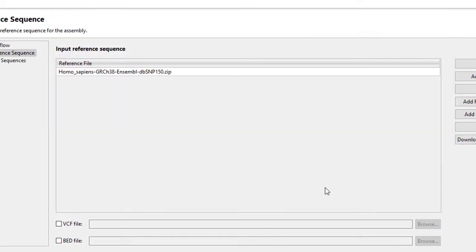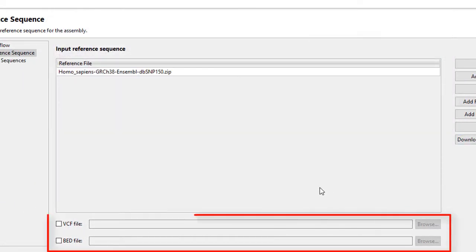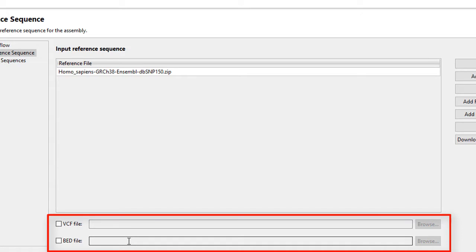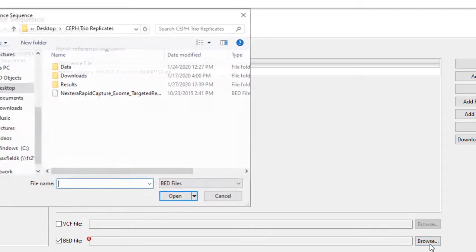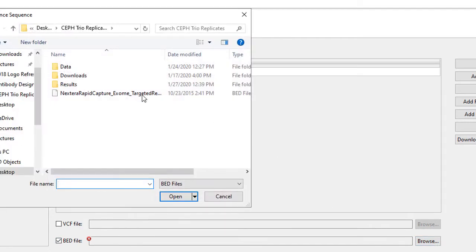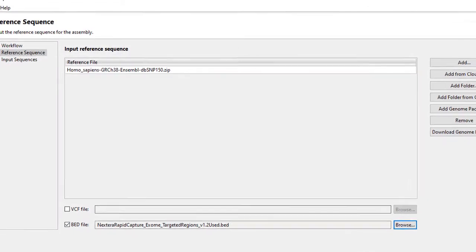If you have them, you can also import a VCF file or a BED file. Note that these files need to use the same genome version as what you've imported into the project. For this example, I'm going to import a BED file that defines the targeted regions in my sequencing project.